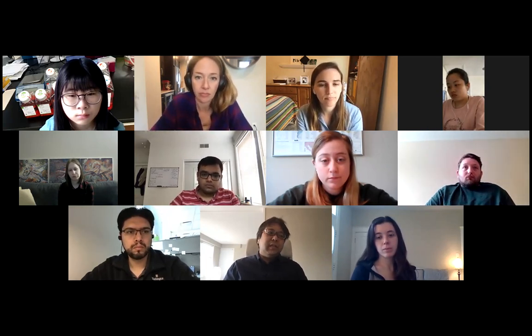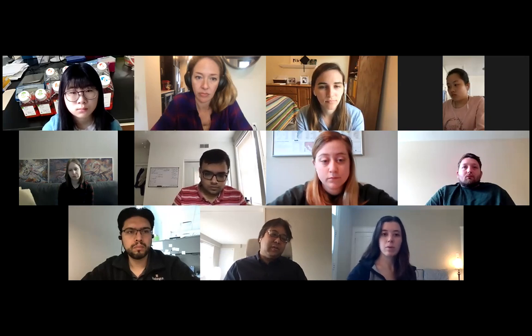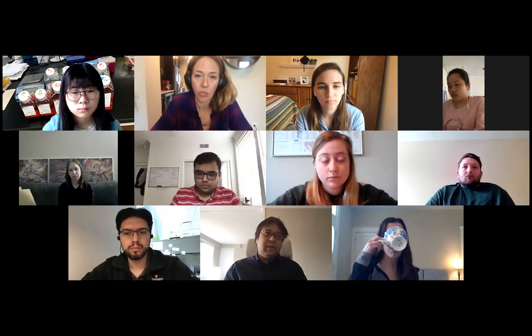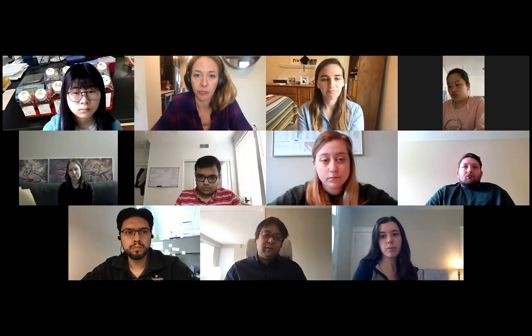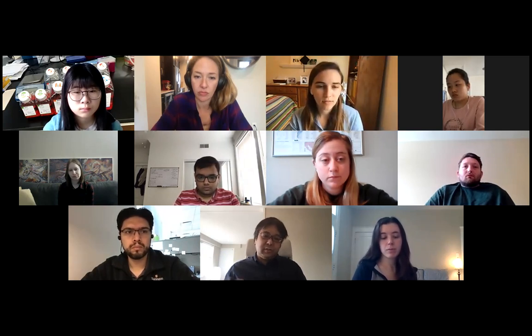The network size is a really important point. Now we just pick the top 2000 genes or top 3000 edges in the first process, but maybe we can do something different for the filtering, or network size selection or something.